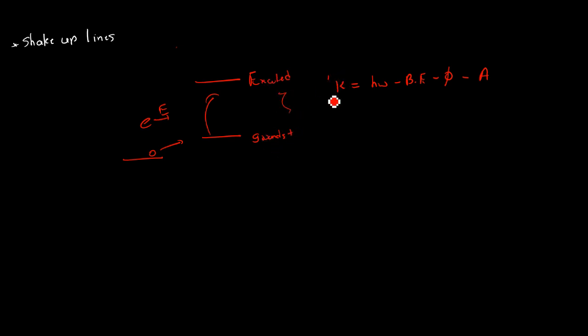Now our kinetic energy is relatively low, right? The instrument doesn't know anything about it. It just sees an electron, captures the electron and calculates the kinetic energy. So when the instrument calculates the kinetic energy, it only sees a very low kinetic energy. The instrument thinks, okay, this electron has higher binding energy, but that's not the reality.